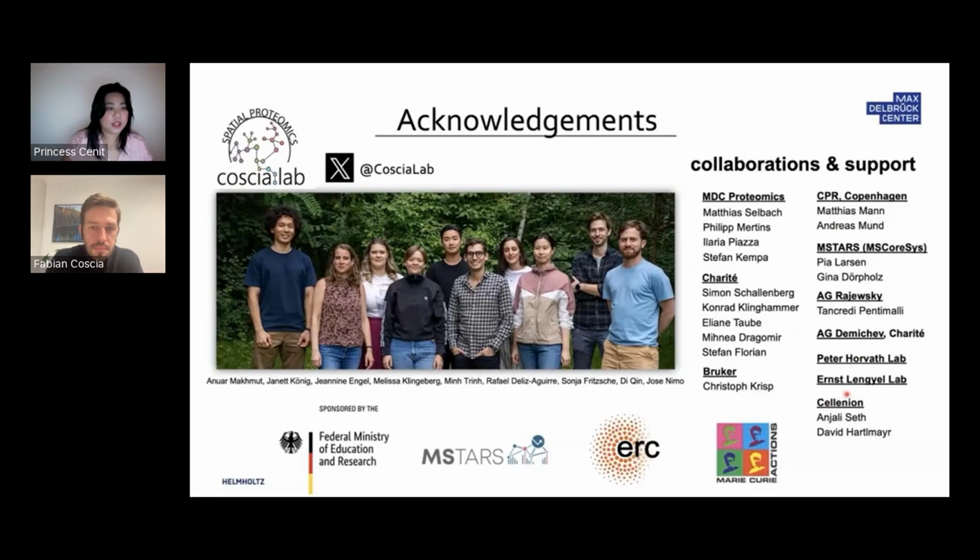Thank you. That sounds great. So shifting gears slightly, why do you primarily work with archival FFPE samples? Wouldn't frozen samples provide higher quality data?